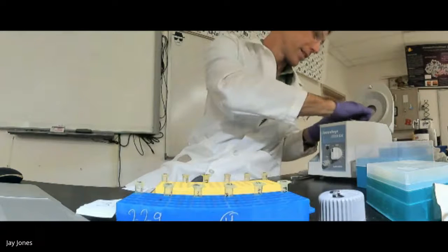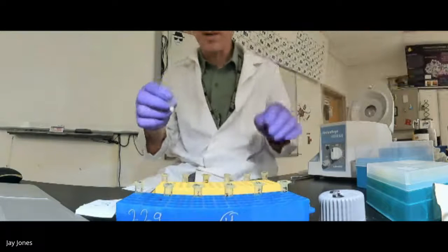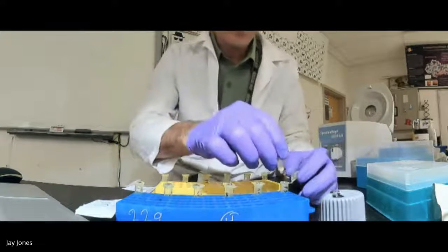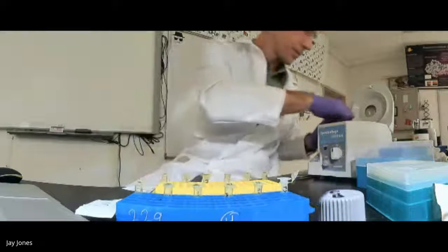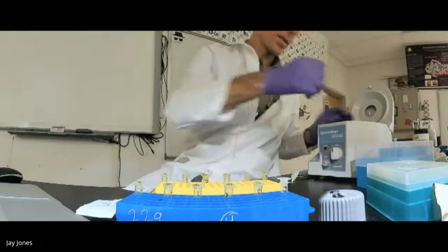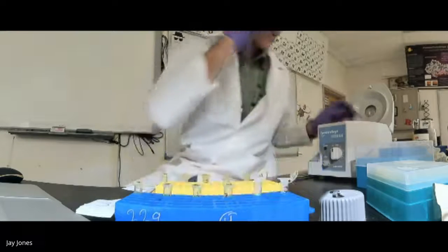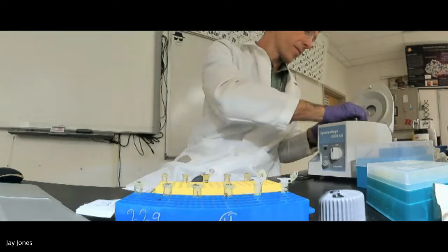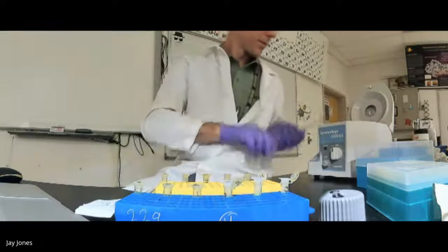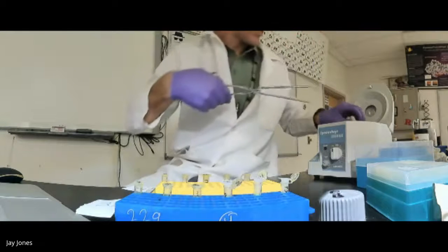All right, let's see how these came out. God, I got to go back and pull these out again. And look, see, there's a tiny bit of ethanol. So the insurance was good. But now I'm done with this collection tube. That goes bye-bye. This is period three. Okay, now this is where the numbering gets weird. So this is going to go directly into tube 12. T5, P3, T5. Collection goes bye-bye. That goes in 11. And this is T4. Goes in 12. God, these things.